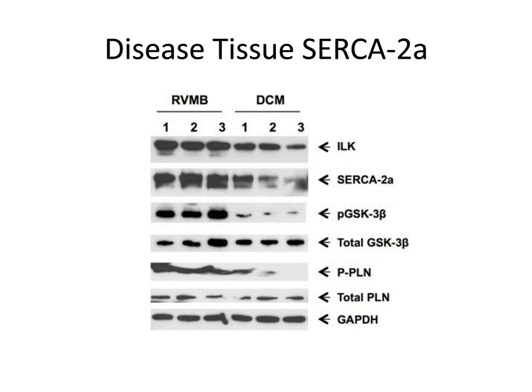As a potential regulatory mechanism for this, we detected that phosphorylated GSK3 beta, which is associated with cardiac contractility, is also decreased in these failing hearts. Importantly, inhibition of SERCA2a is increased. So the natural inhibitor of SERCA2a is phospholamban, or PLN. When PLN is phosphorylated, in our blot here shown as PPLN, then inhibition of SERCA2a is lost.